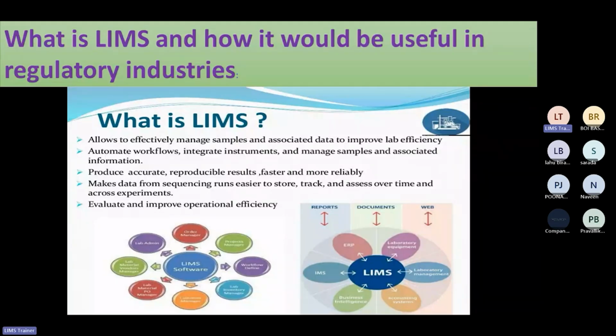We are doing some analysis, performing some tests with the sample, and generating the data, right? This data that is generated is required to be preserved. It is required to be shared from one lab to another lab, or from one person to another person, like the manager or the reviewer. This is how the data is required to be handled. To make it easy, this particular software is utilized.